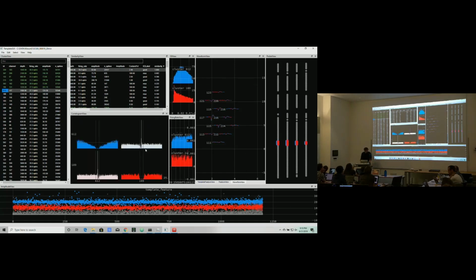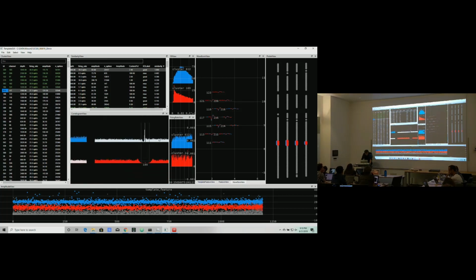Well, we don't really know. This really big thing? Yeah, sure. I mean, that's what we think, but let's see if it could be an artifact. So that's a good thing to do. If this looks like it's way too huge of a peak to really be a connection, but who knows? Let's see.